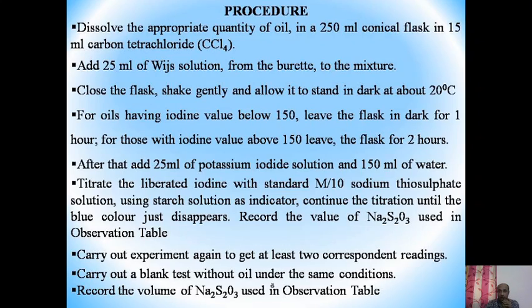For oil having an iodine value below 150, leave the flask in the dark for 1 hour. For those with an iodine value above 150, leave the flask for 2 hours. After that, add 25 ml potassium iodide solution and 150 ml of water.